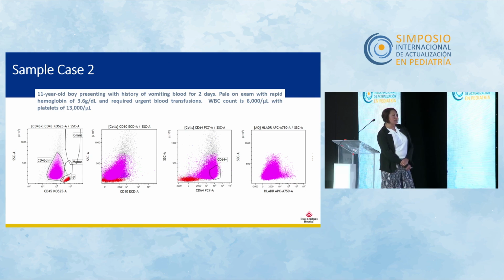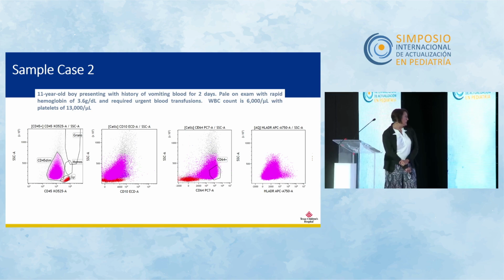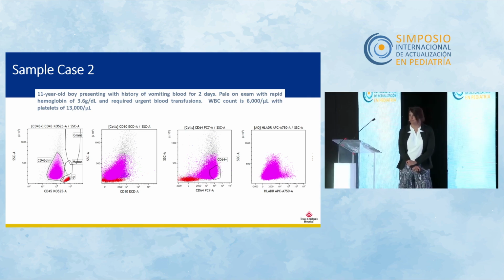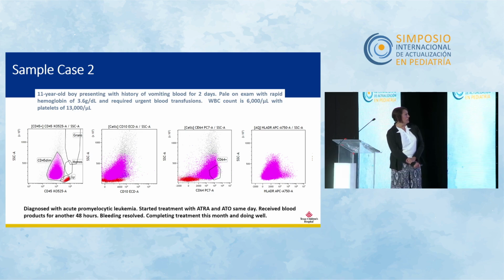There's a very specific pattern in here that hematopathologists can pick out. So on the left, now our blasts are in pink. And you see it looks like a flame. This is very characteristic of that type of AML that I mentioned, APL, acute promyelocytic leukemia. These kids can die from bleeding if they don't get treatment within a very short period of time, day or two. There are also a couple other characteristic things for that type.